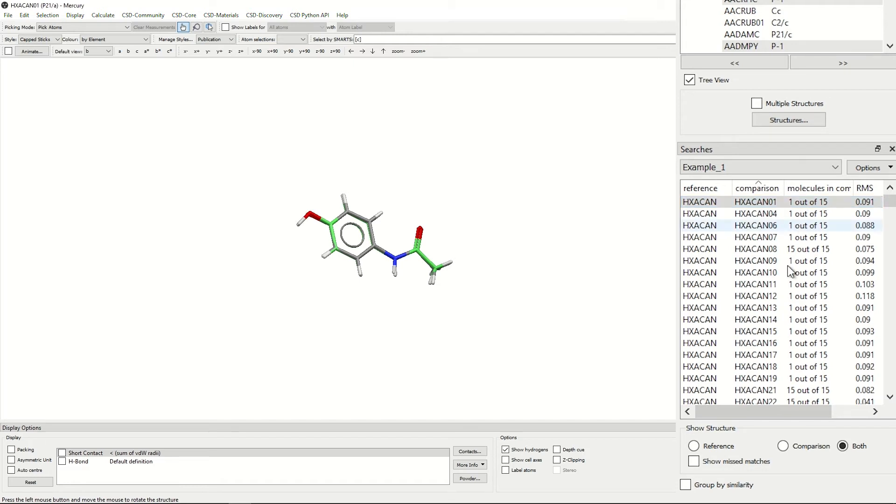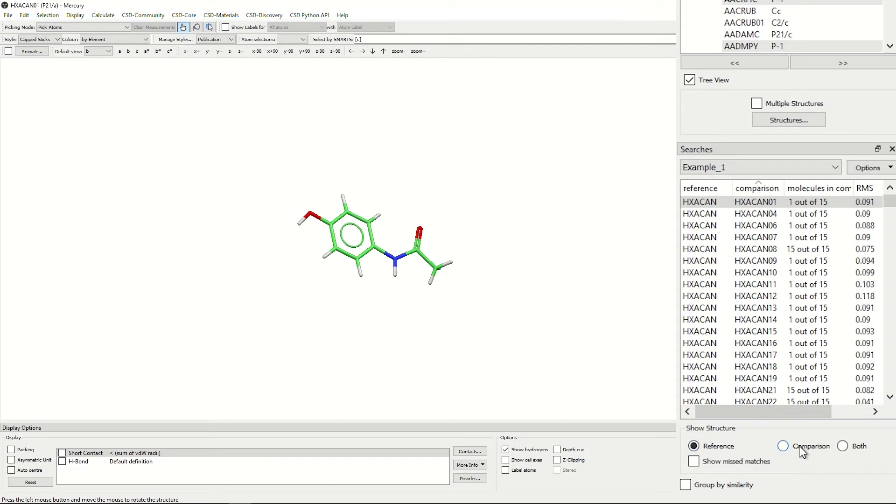If you go down below the list, you can see reference. So if you click reference, it will show you the reference structure. Comparison, it will show you the comparison structure where all of the carbons have been changed to green. This means that this molecule was able to successfully overlay.